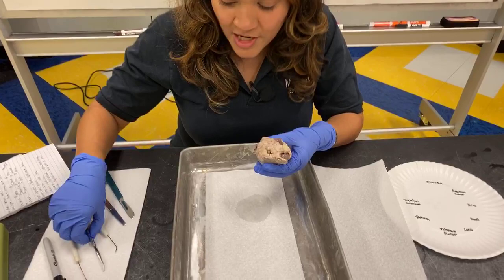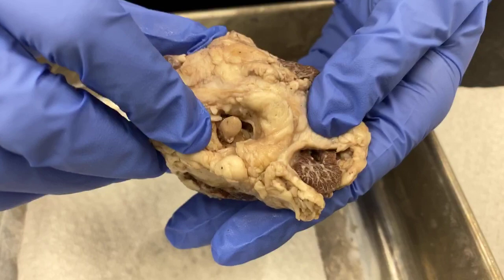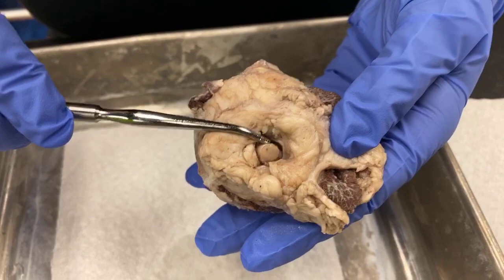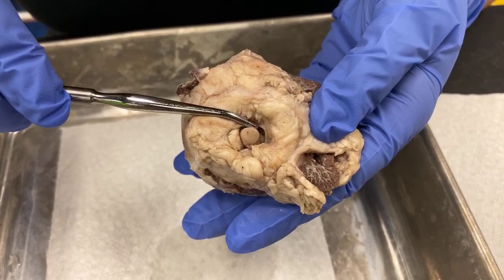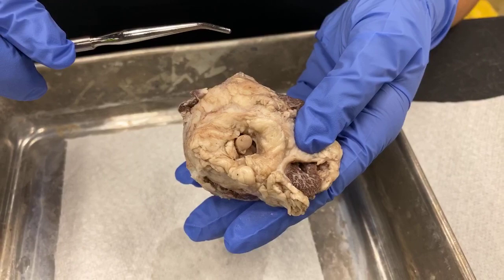One more thing I want to point out in the back is this right here. If you were able to feel it, it's a little bit harder — it kind of feels like a pencil eraser — and that is the optic nerve. We didn't really talk a lot yet about how the eye works, but the eye works with the optic nerve and the brain, and all three of those help us see. This is a very important part of the eye and we'll see it again towards the end of our dissection.